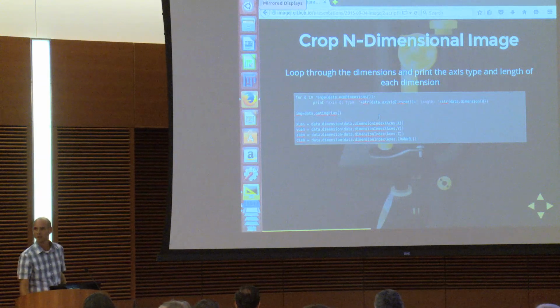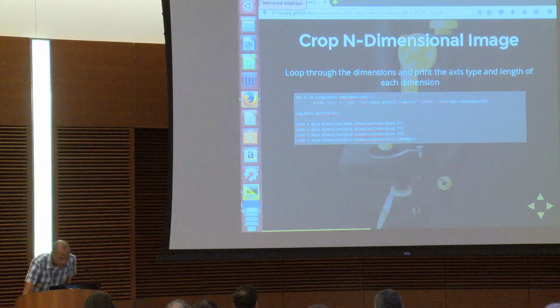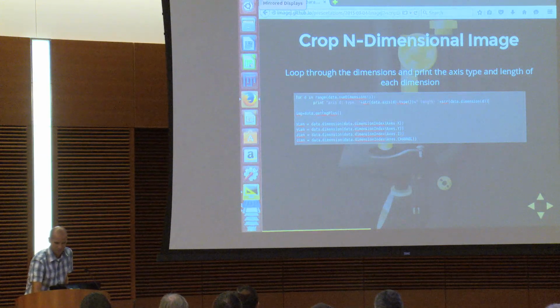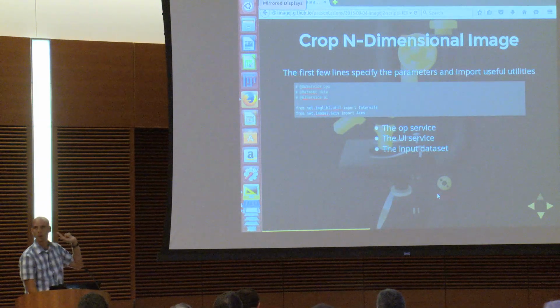How do all these commands know that you're referring to the image? IMG is where you get the image, but the loop and the x-line and all that, do those have any reference to IMG? Okay, so that's a really good question. Let's go back a step. What I did here is my parameter is called data.